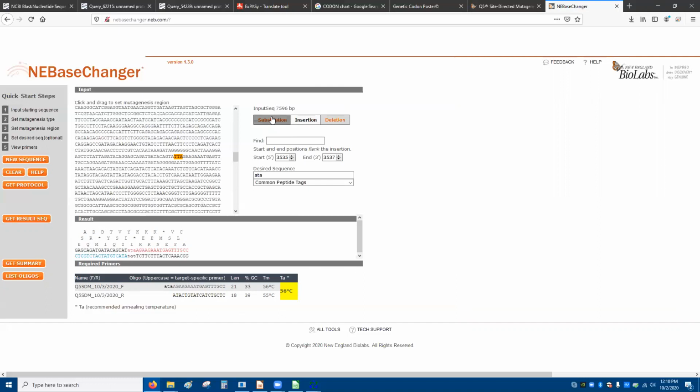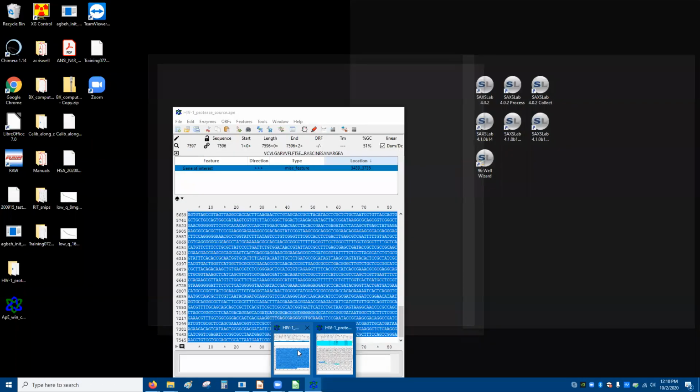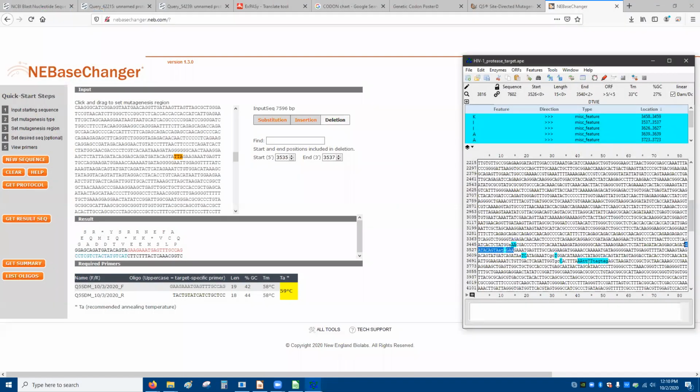We don't have any deletions to do, but theoretically, say we wanted to walk this back here. Let's say we want to get rid of F.